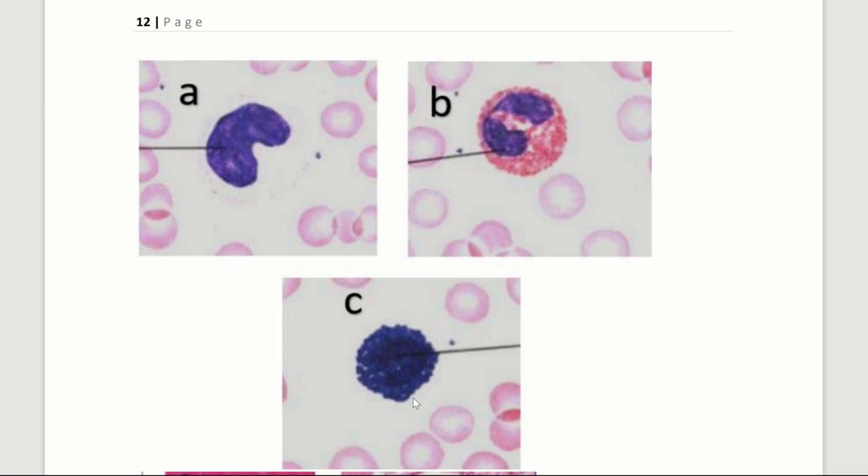That's because in a lymphocyte, all the blue that you see is actually the nucleus, right? And they have this very large monochromatic nucleus, meaning same color, one color nucleus. See all the graininess in this cell? That tells me that that's not due to the nucleus, it's due to the granules, okay? And remember, basophils are going to be the white blood cell that has those very large dark blue granules, right?